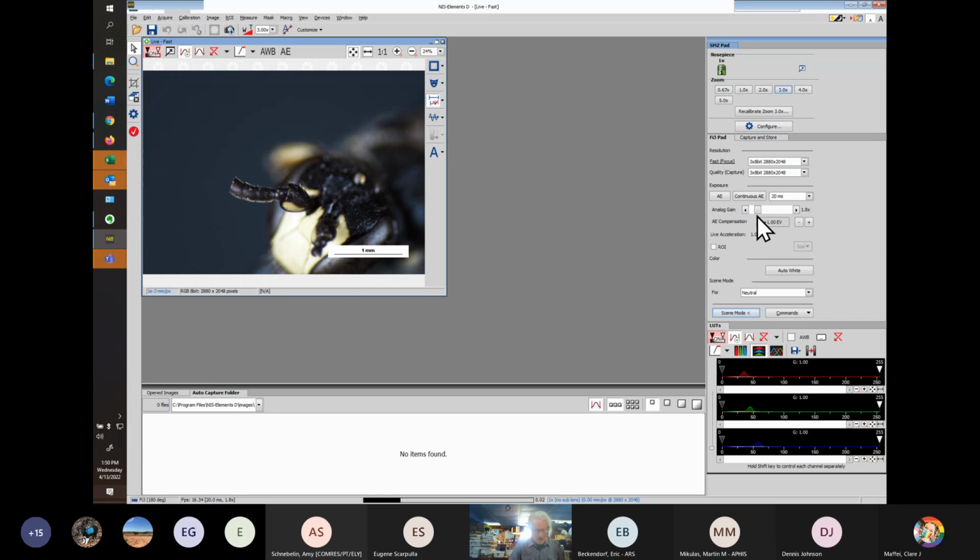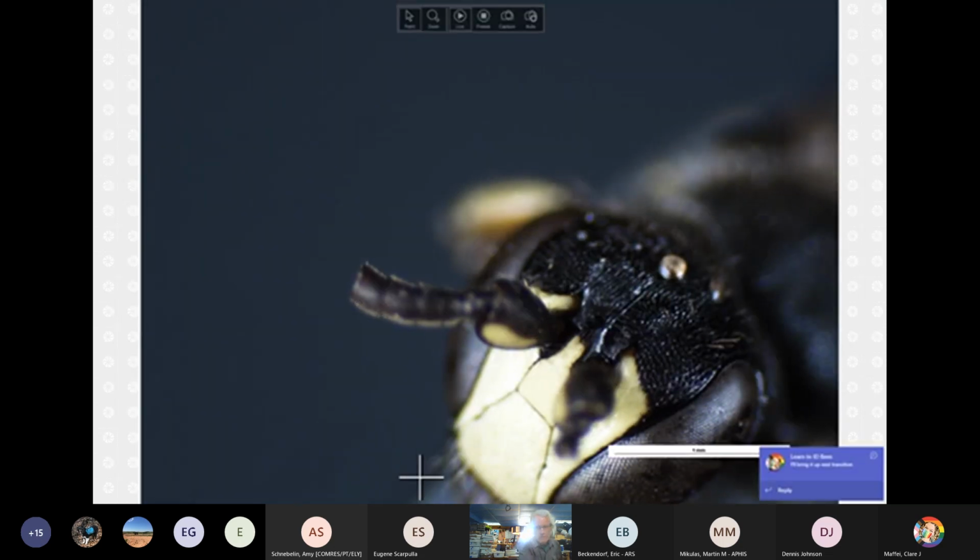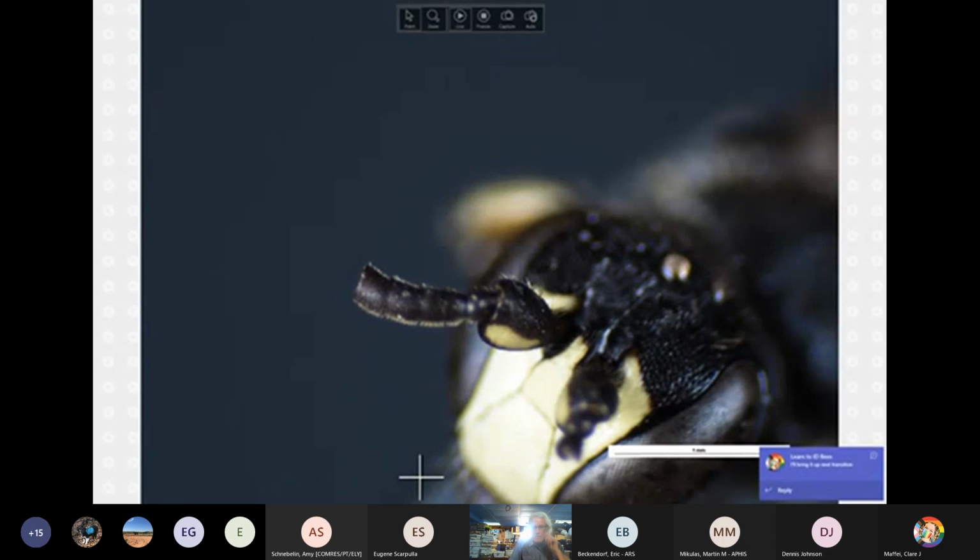And what we want to look at here is the pattern around the antennae. There we go. So I'll change the view on this, so hopefully it'll be better, but this is actually not a bad view. Recall in mesillae that the markings diverged from the eye and went around the base of the antennal segments. It does that here too.